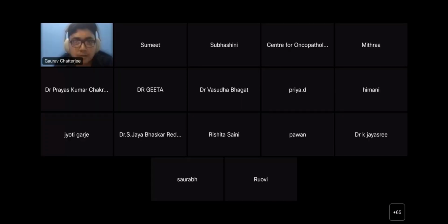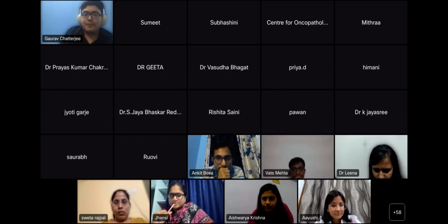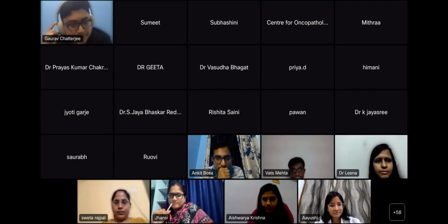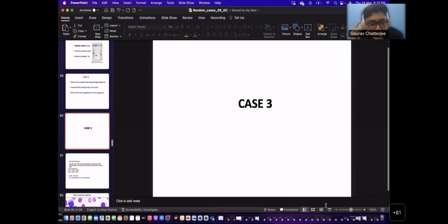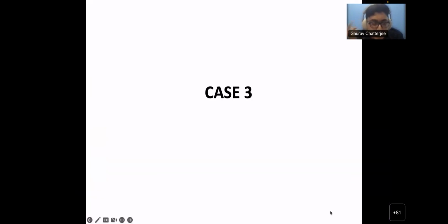So Gaurav, the conclusion is eosinophilia, ALLs can present as eosinophilia. Yes, they can. ALLs can present, and there are those cases where you have to think about what the underlying fusions are, and it may not be just a routine case of ALL, and we have to look for other features as well. Anything in the chat section?